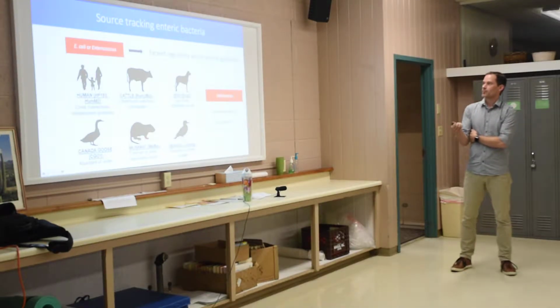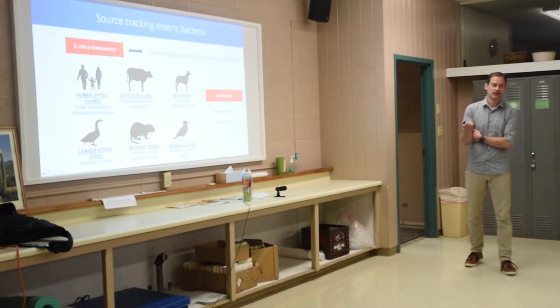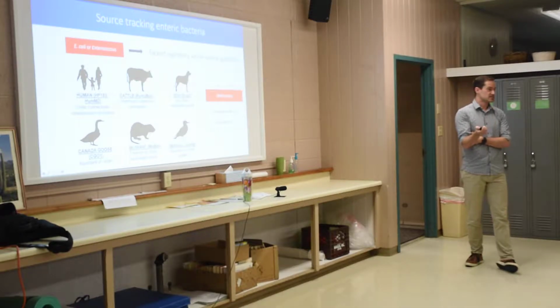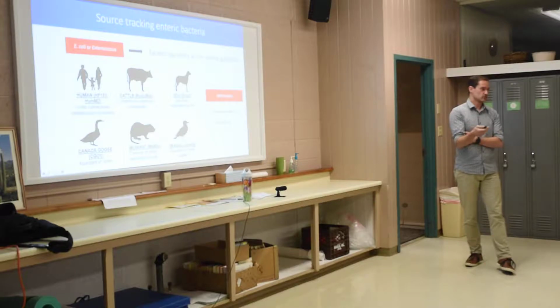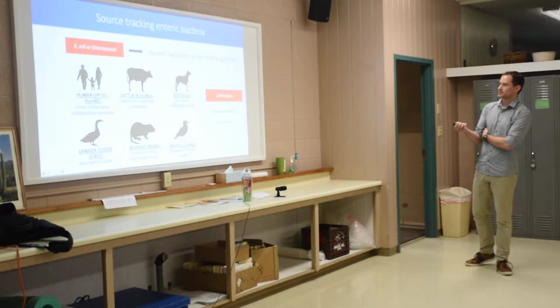Now, where I am in Alberta, we run the Enterococcus test, and there's some reasons for that. One of them is that the Enterococcus test correlates slightly better than E. coli for enteric disease development. So if you exceed an Enterococcus guideline, you tend to have a higher correlation with enteric illness in a person swimming at that location than you do with E. coli. So that's why we use Enterococcus.